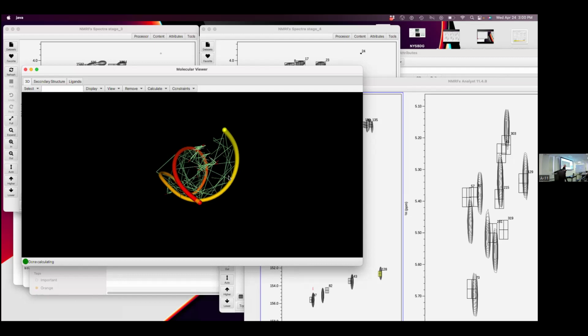I worked on optimizing the 3D structure calculation tool, which is called Ponderosa. We combined Ponderosa and Sparky, so we named it Pokey. I just worked on optimizing the parameters for Ponderosa. I'm not the developer of all of it.